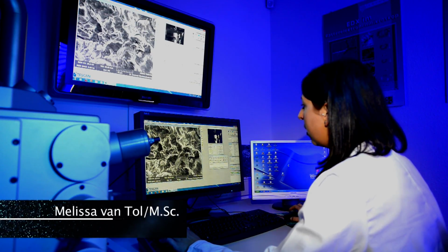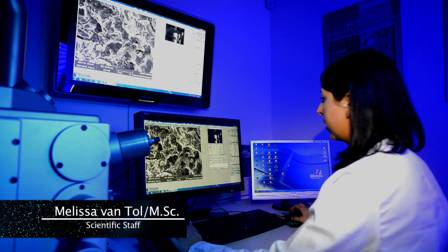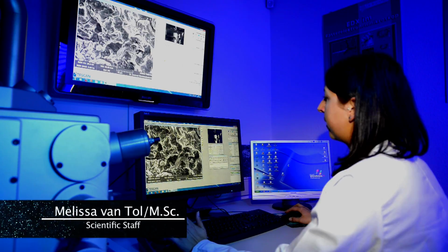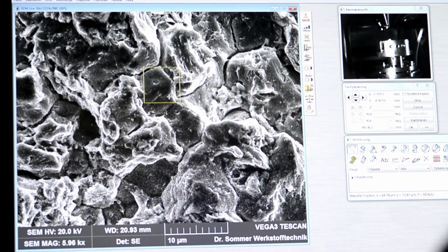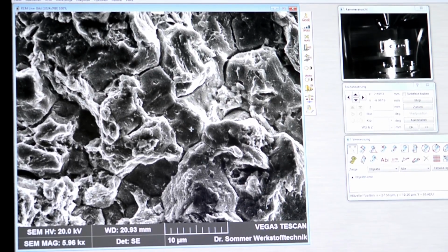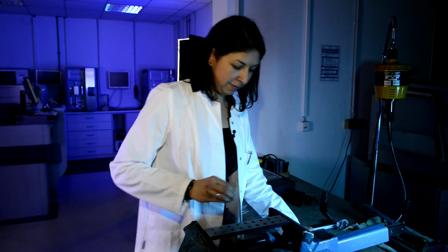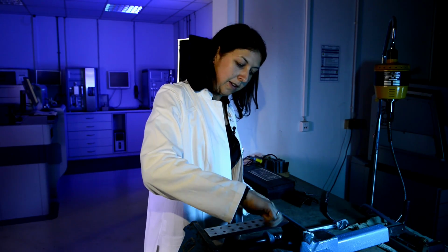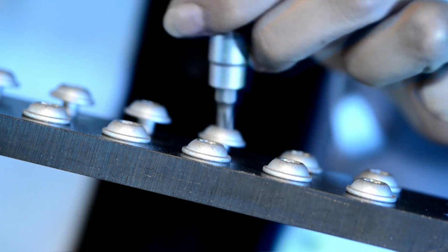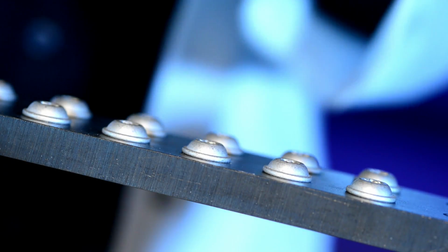Here, we are at nearly 6,000 times magnification, where we can see very fine intercrystalline fractures, gaping grain boundaries, and we have microcrystal honeycombs on the intercrystalline fractures. This is a clear indication of hydrogen embrittlement. A first clue. In the next investigation phase, the so-called stress test, the susceptibility to hydrogen embrittlement is tested. If this screw breaks within the next 96 hours, then we have clear proof of hydrogen embrittlement.